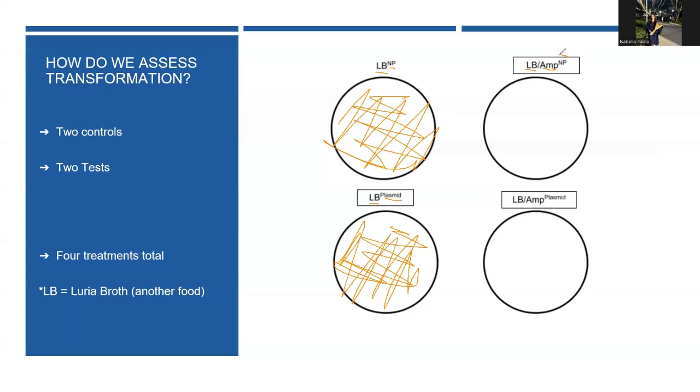However, you're dispensing regular E. coli with no plasmid into here. What should happen in this case is since that E. coli has no way to fight against the ampicillin, there's no growth. The bacteria is completely killed off by the ampicillin that's infused into the plate, and you see no growth happen.